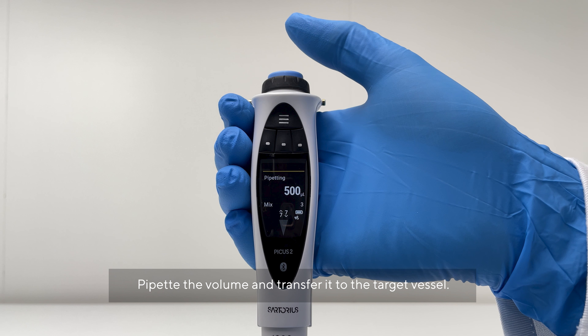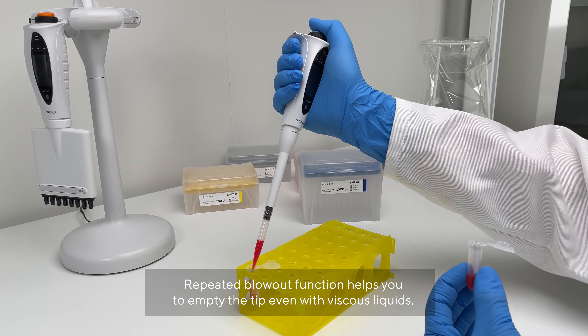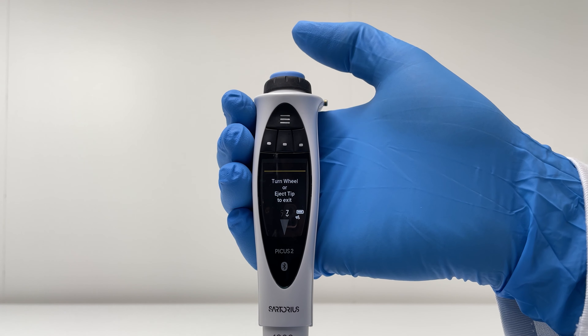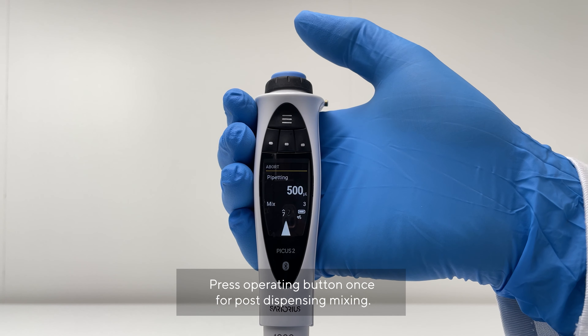Pipette the determined volume and transfer it to the target vessel. The repeated blowout function helps you to empty the tip, even with viscous liquids. Press the Operating button once for post-dispensing mixing.